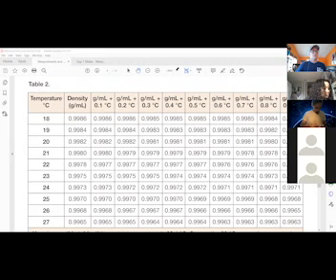Okay, so let me go back. Question? Yes. What would you look up again? Oh, the density of water. If for instance, your temperature is less than 18, which it very well could be, it's the Bay Area, right? I doubt it's more than 27, unless you're living in an old folks home. If your temperature is less than 18, just Google density of water, whatever your temperature is, Celsius, and then boom, you'll just get an answer. And then use that density to do your calculations, okay?